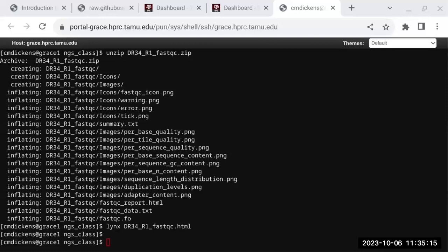This is about overlapping. Fragment 1, there's no overlapping. Fragment 2, there's some overlapping. So for the first one, you will have a left and a right pair. But for this one, you can combine these two because we know DNA is complementary. So we know the rest of this sequence here, this gray part, because we've sequenced the other strand.